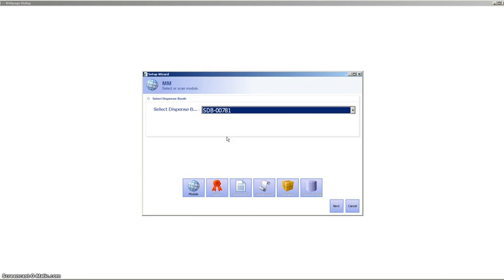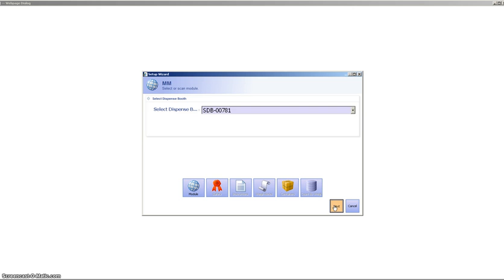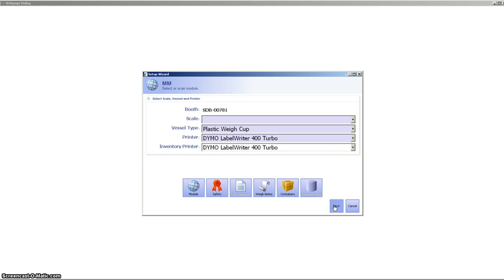I'm doing this from a drop-down box, so we could also use a barcode scanner. When I hit next here, the system's actually going to go out and check the status of this dispensing booth, and if everything's okay, it will proceed.